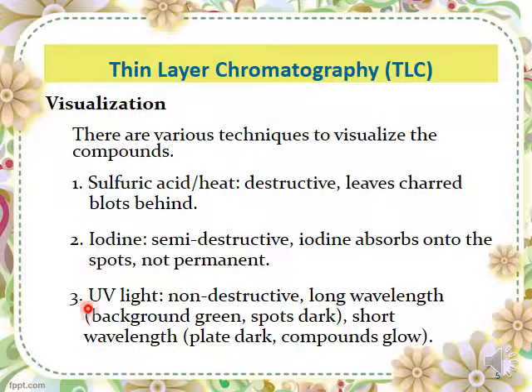The third technique is using UV light, like you normally see in any supermarket to check whether your money is real or not. This technique is non-destructive because it only uses UV.